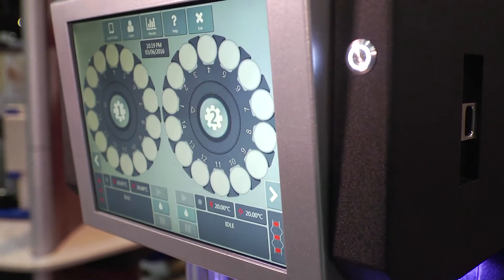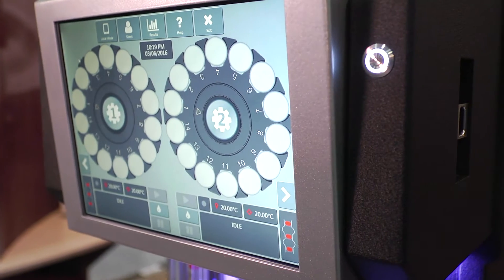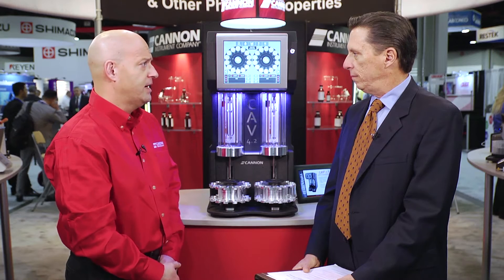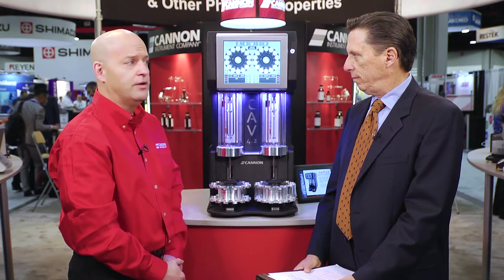What does standalone mean for the CAV 4.2? The CAV 4.2 has an integrated computer with a color touchscreen system, very fluid, similar to an Android-type interface, and the system allows fully unattended operation without a standalone PC. But because of the modular architecture, we can control up to four of these systems connected to a PC software system known as VisPro, that offers LIMS output capability.